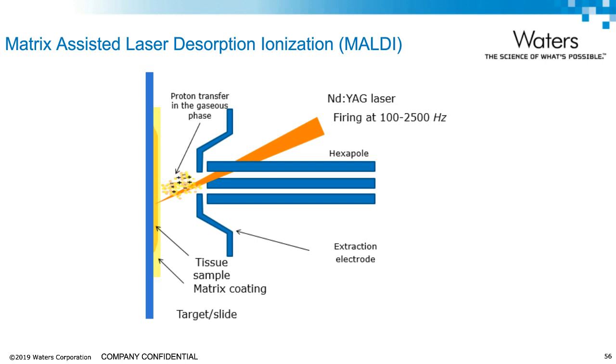It is similar in character to electrospray ionization in that both techniques are relatively soft ways of obtaining ions of large molecules in the gas phase, though MALDI typically produces far fewer multiply charged ions. Spectra from both electrospray and MALDI also show low fragmentation.